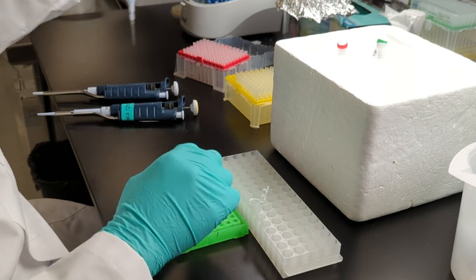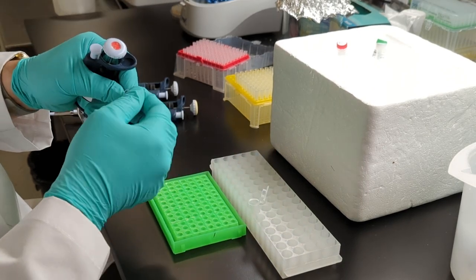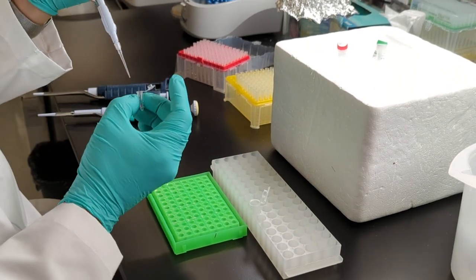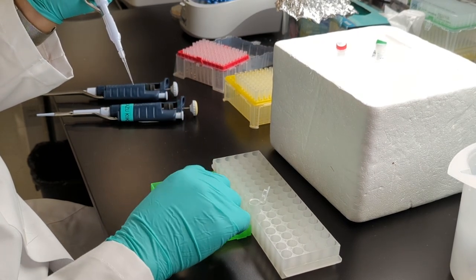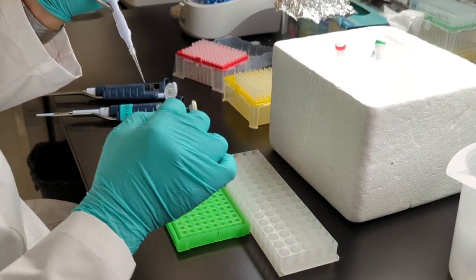Following amplification, dilute the unpurified PCR product 5 to 10 times utilizing the provided dilution buffer. Please note that increasing PCR product purity correlates to increasing cloning efficiency.